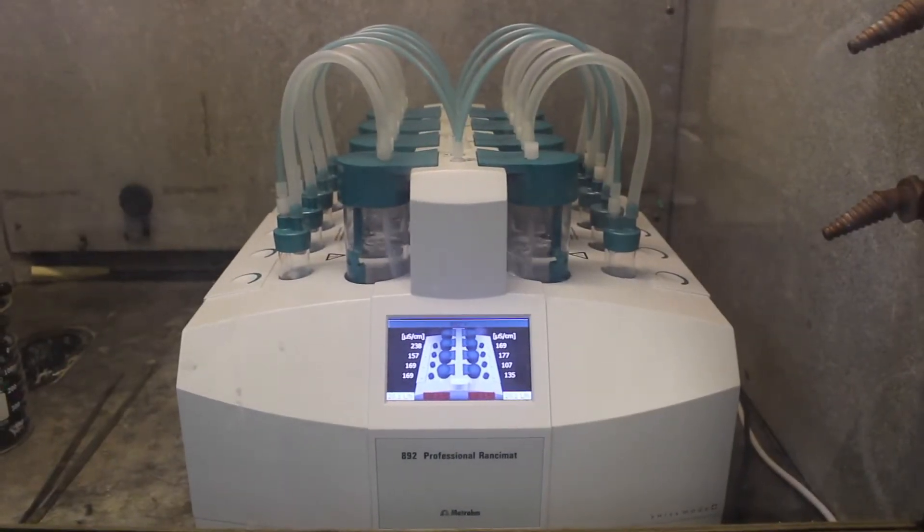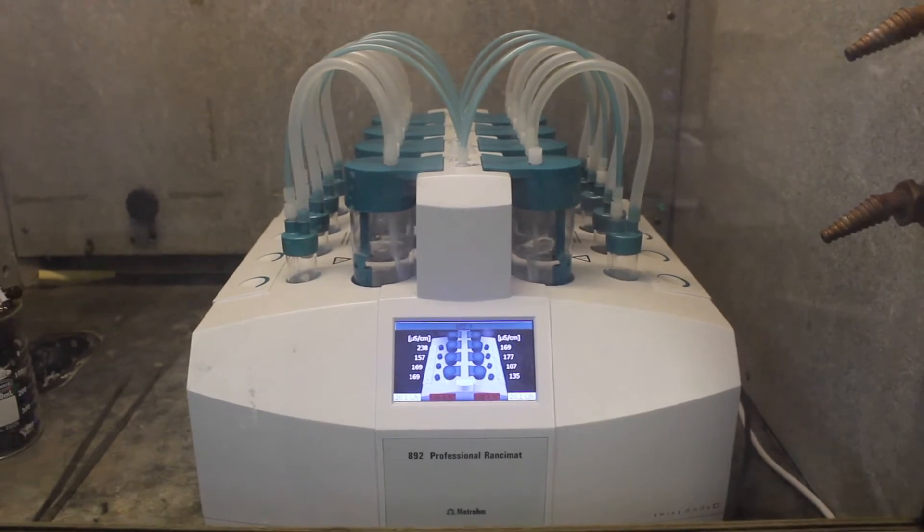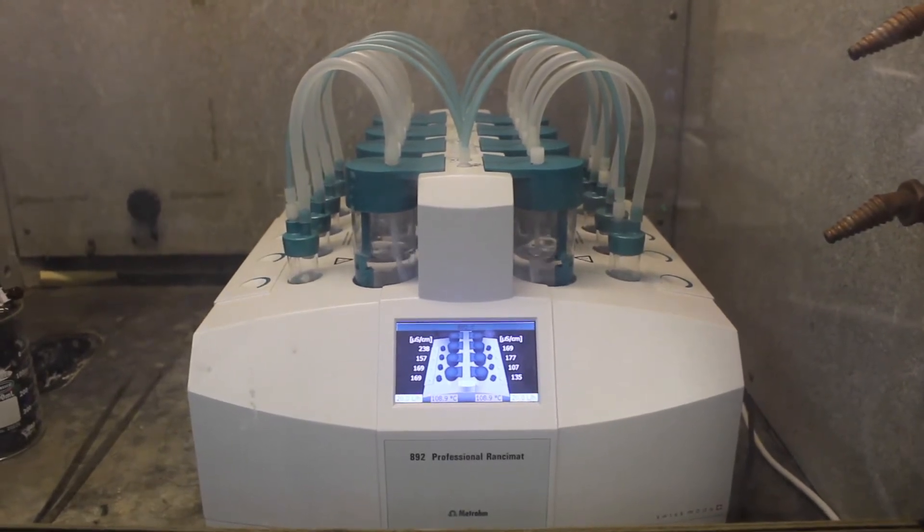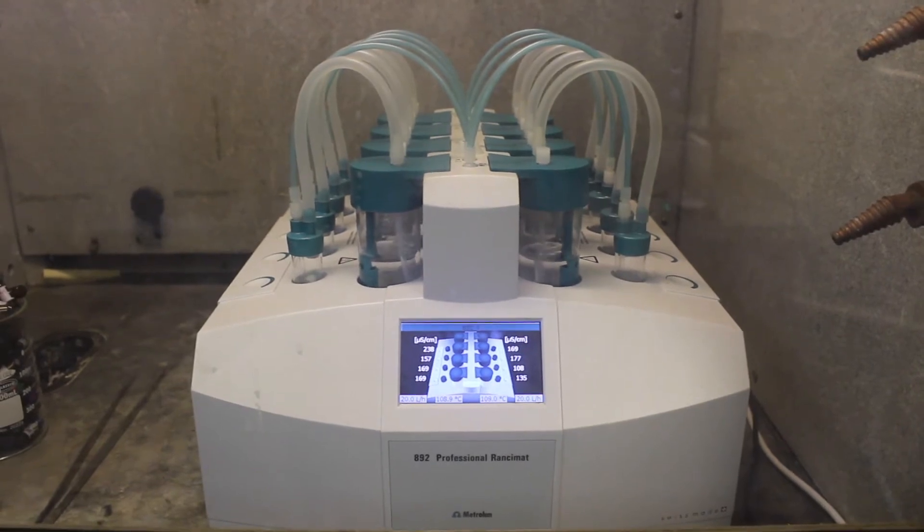Now we are entering our second lab room. This is a Rancimat, and it is a tool to determine oxidation stability based on accelerating the aging process. We have used this instrument for olive oil, fish oil, walnuts, walnut oil, and almonds.